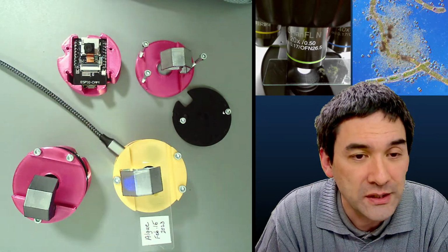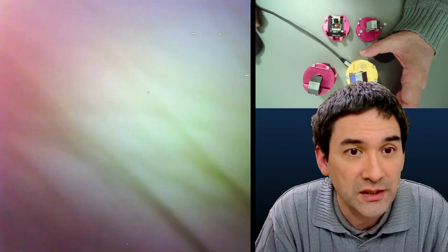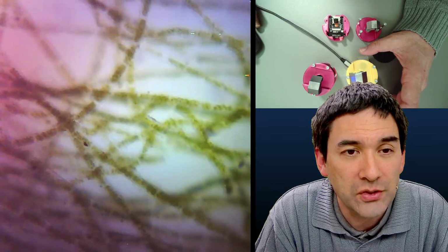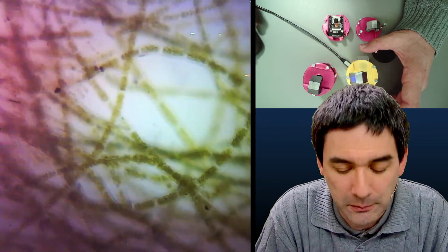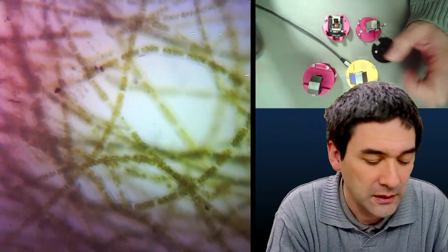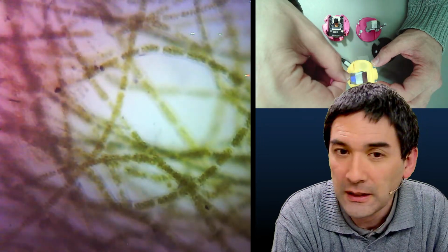And what I'm going to do is I just put the slide on here, and I'm going to show you what you're able to see. So this is now the live view using this tiny microscope. You see it's a little bit blurry. I have to focus it a little bit, so you can use a little tool here to focus it by turning it here.